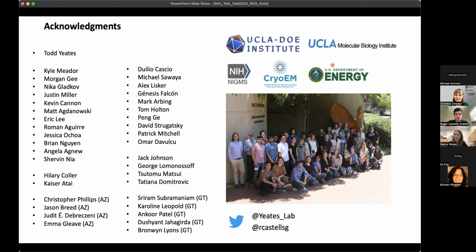So yeah, you can adapt the protocols, but sometimes the new tools or ideas go so fast that you just say, okay, I already got this structure, I don't want to reprocess it, I'm going to use this new approach for this new one. But lots of things that you learn for one of them, you can then apply to other structures that you want to solve.